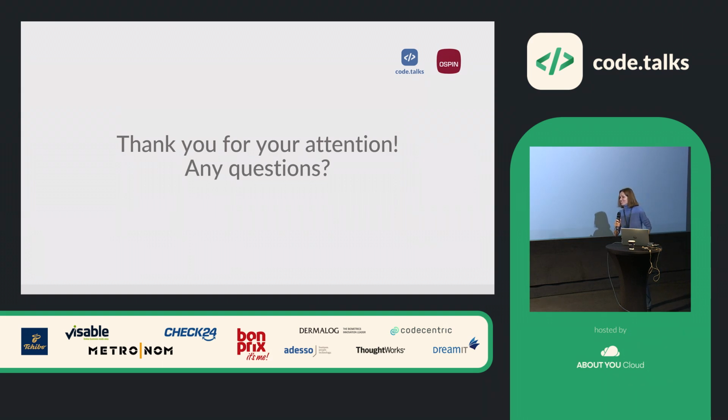I assume the programming is highly local, what you can program on a bioreactor is highly local to what sensors you have or how you configure it. So if I were a biologist getting started with it, I probably want to set up my machine first. So what's the latency? I guess you need to hand build it according to the layout, or is this also automated? So no, maybe I can go back to here.